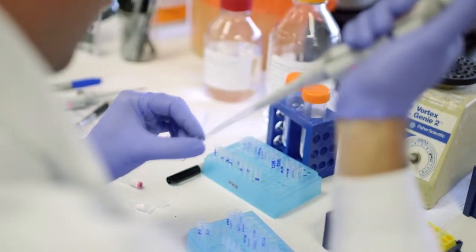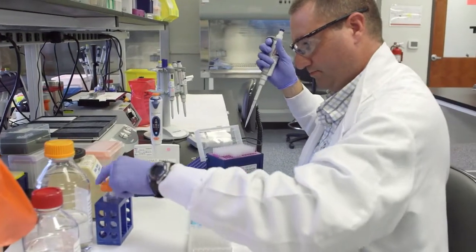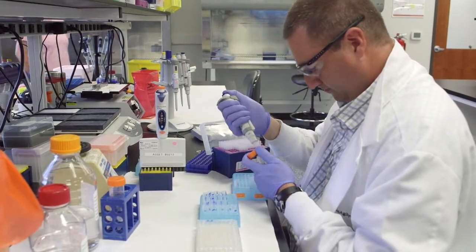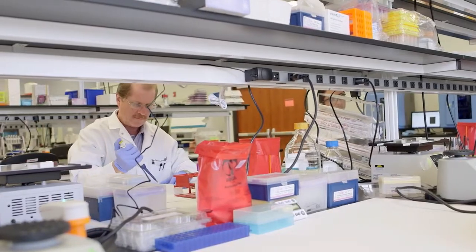Any quantifiable measure of drug activity in a cell-based system may be evaluated for its use as a model assay. These assays are often very specific biochemical measures, such as enzyme activity, protein secretion, receptor phosphorylation, or ligand-stimulated proliferation. Once activity is defined, the assay is validated for its reproducibility in the appropriate clinical trial sample, such as human serum. You must ask yourself, can the measures of accuracy, precision, specificity, selectivity, and stability of my chosen method be performed to ensure long-term reliability of my assay for supporting the clinical trial?